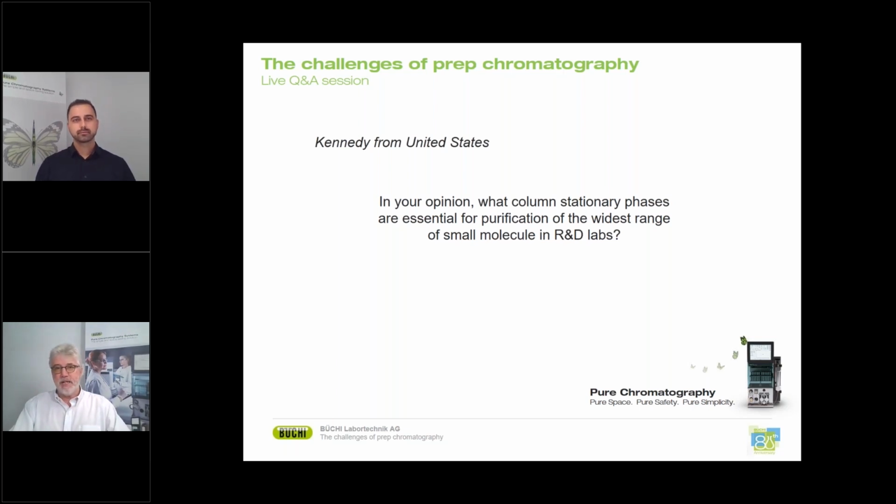There are reasons for that. And what I would recommend is that, first of all, you look at polarity and solubility of your compounds, because that's determining a bit what you will do afterwards.